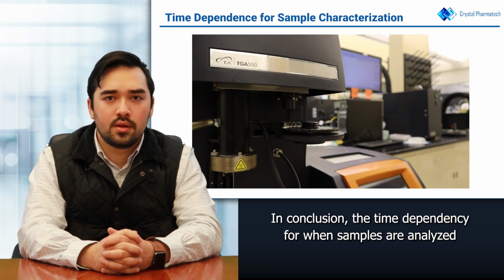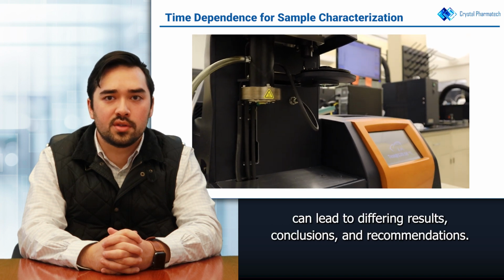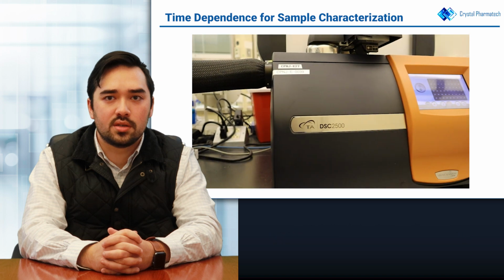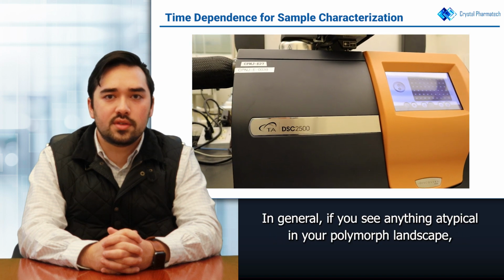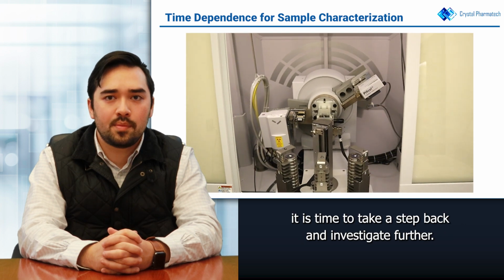In conclusion, the time dependency for when samples are analyzed can lead to differing results, conclusions, and recommendations. In general, if you see anything atypical in your polymorph landscape, it is time to take a step back and investigate further.